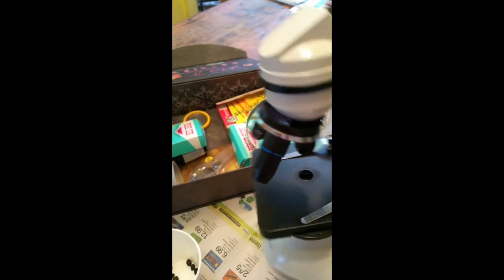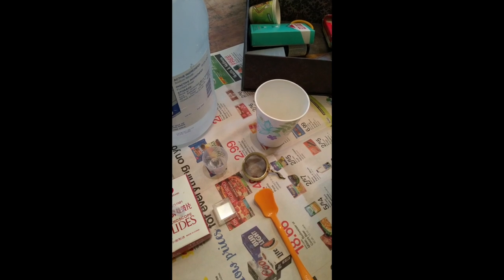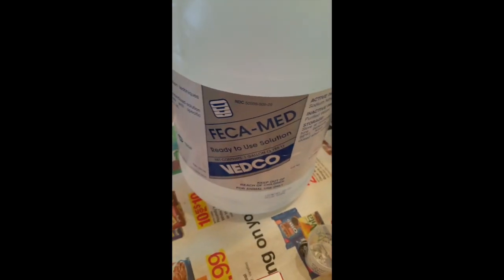Then it'll go up to 40x, and what I'm going to be looking for is worm eggs. This has been sitting around for a while so I'm going to give it a really good shake - maybe even turn it upside down.